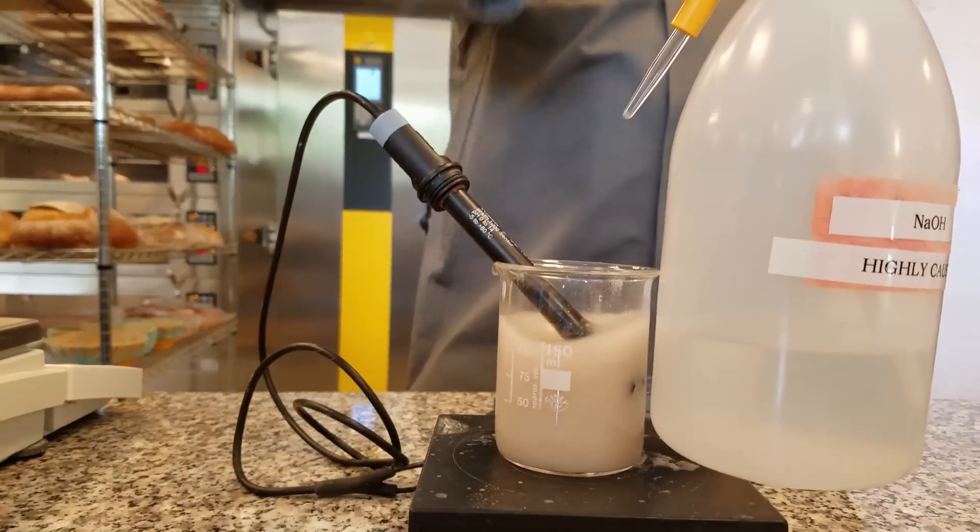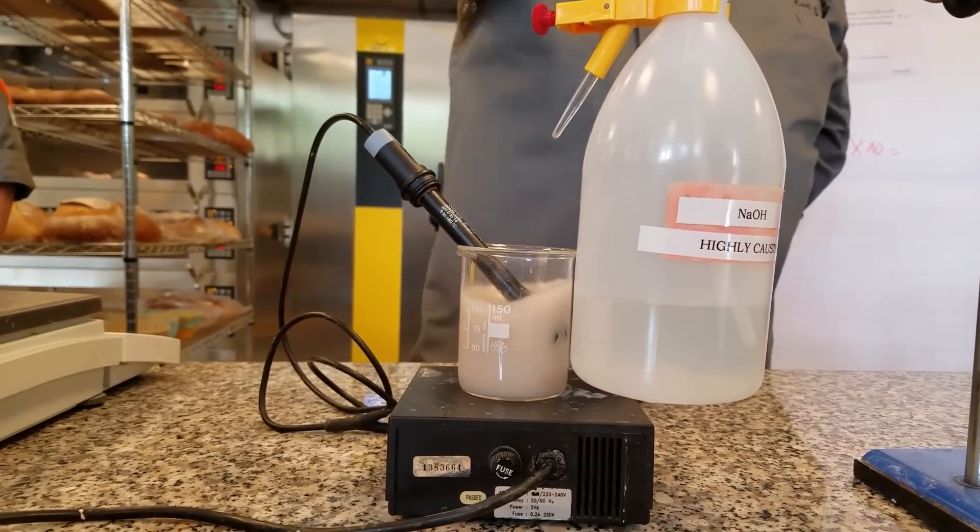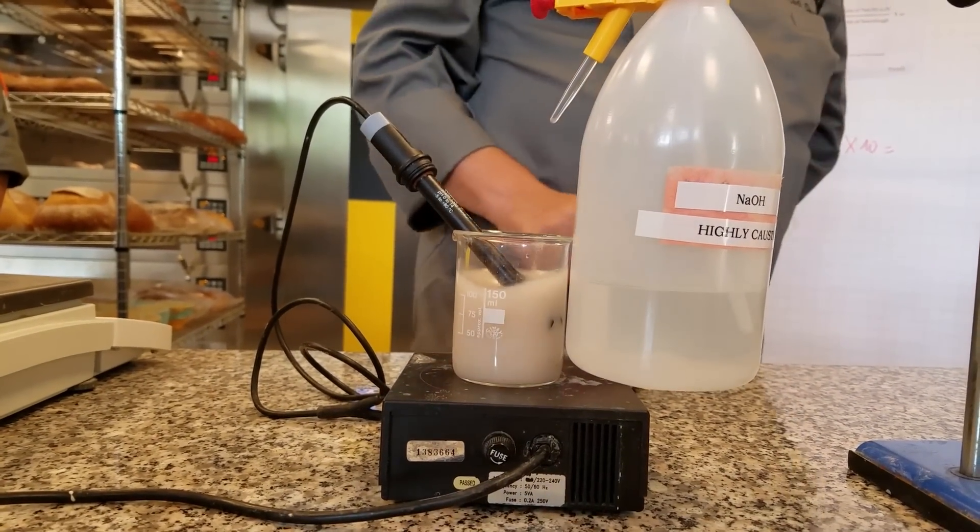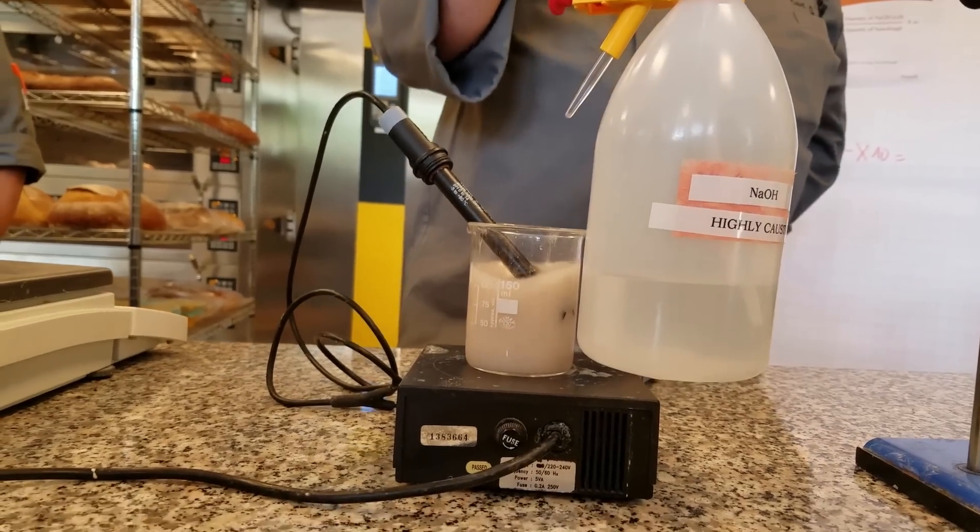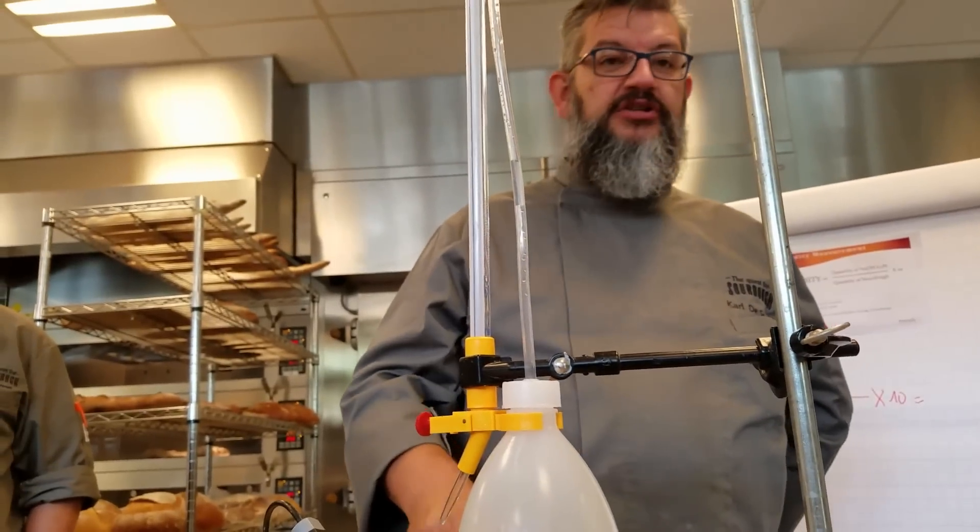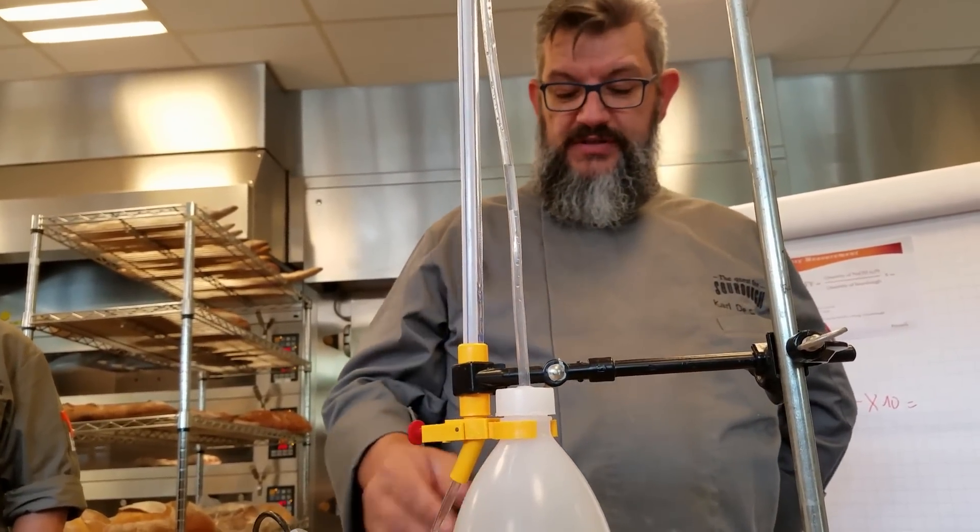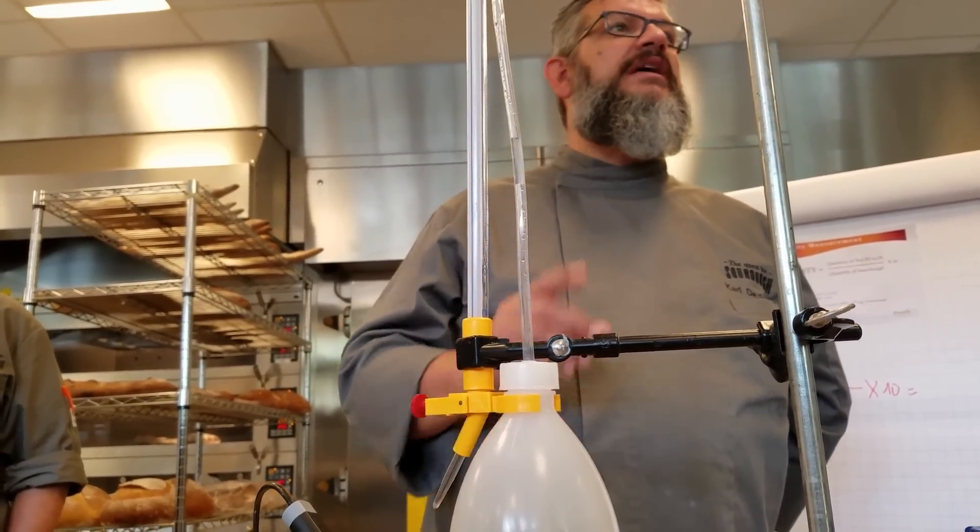So little by little, I'm going to open the little valve here and the droplets are going to fall. This is highly base, so it's a very high pH. So what is going to happen, when I'm adding little by little the droplets of sodium hydroxide, my pH is going up. And I will add sodium hydroxide until my pH is reaching 8.4.